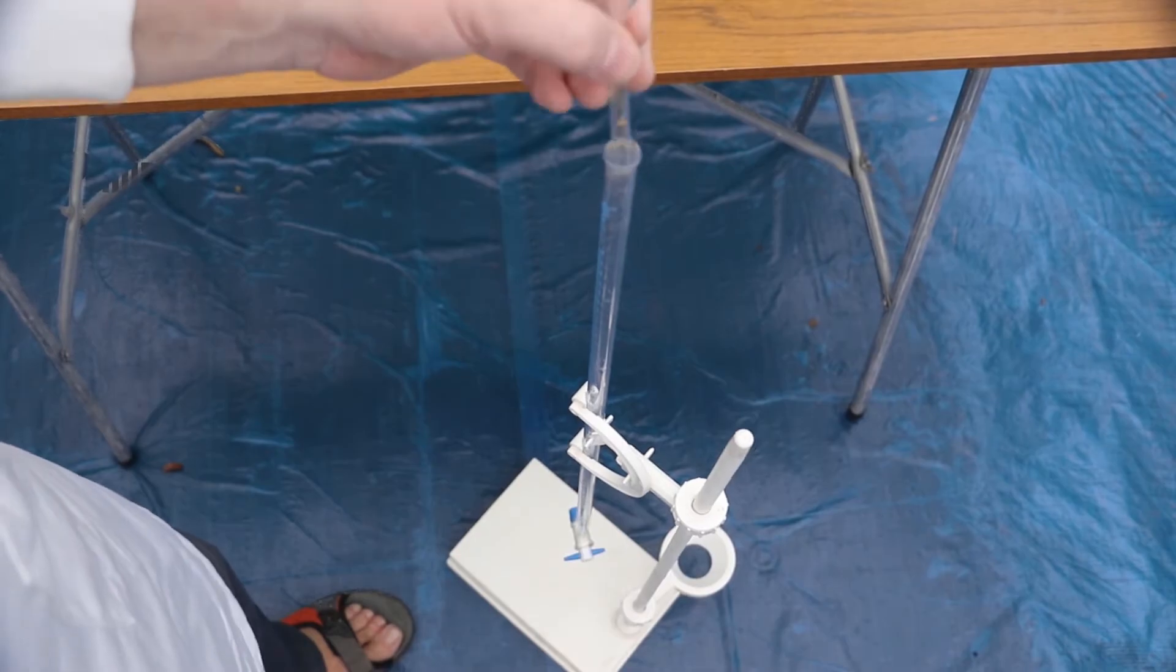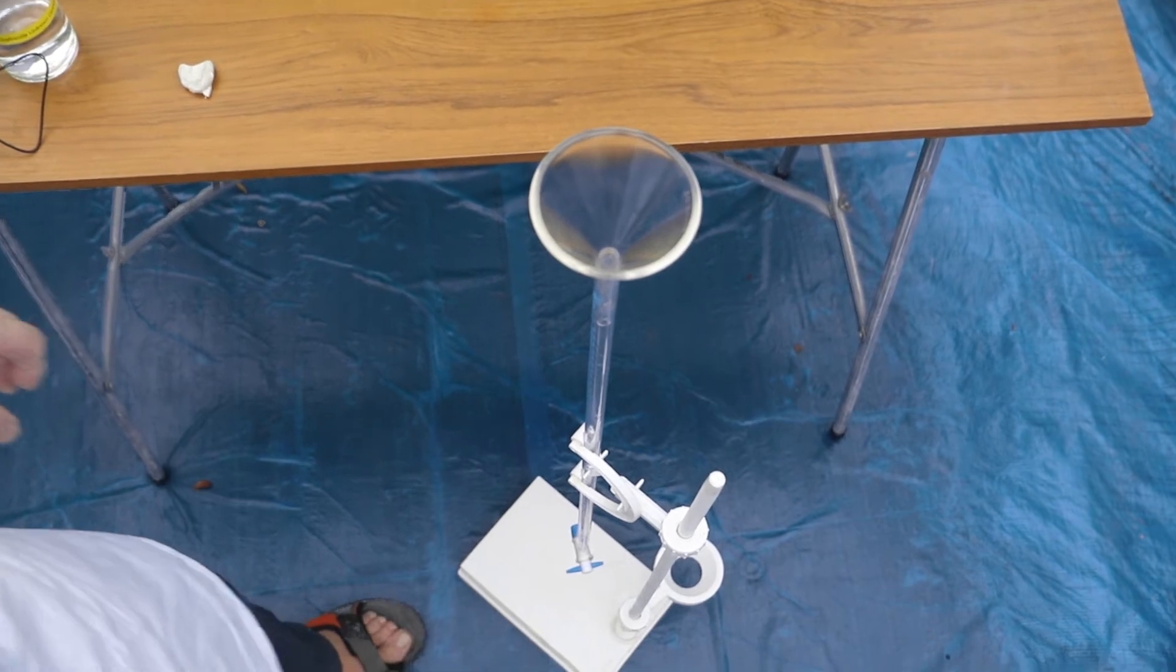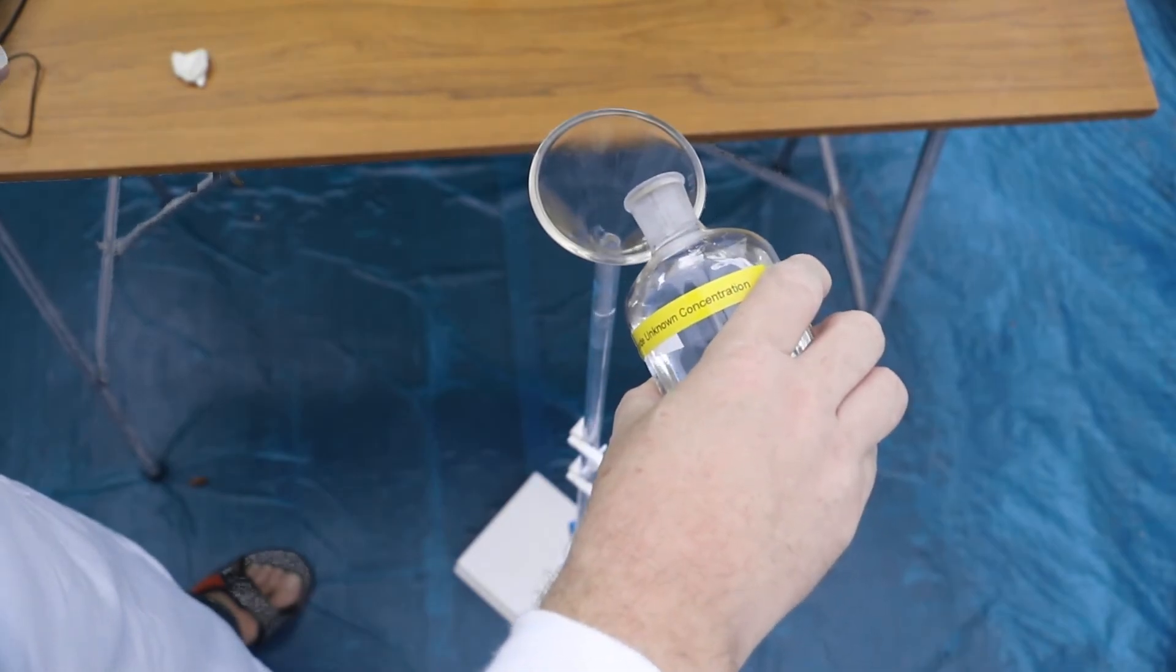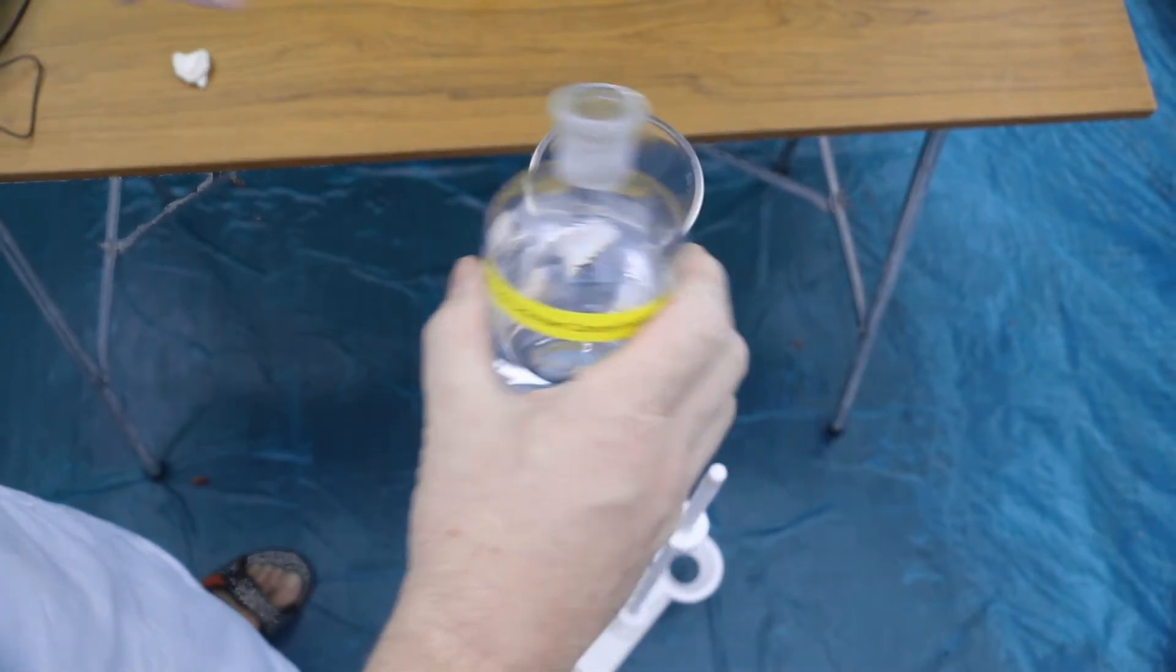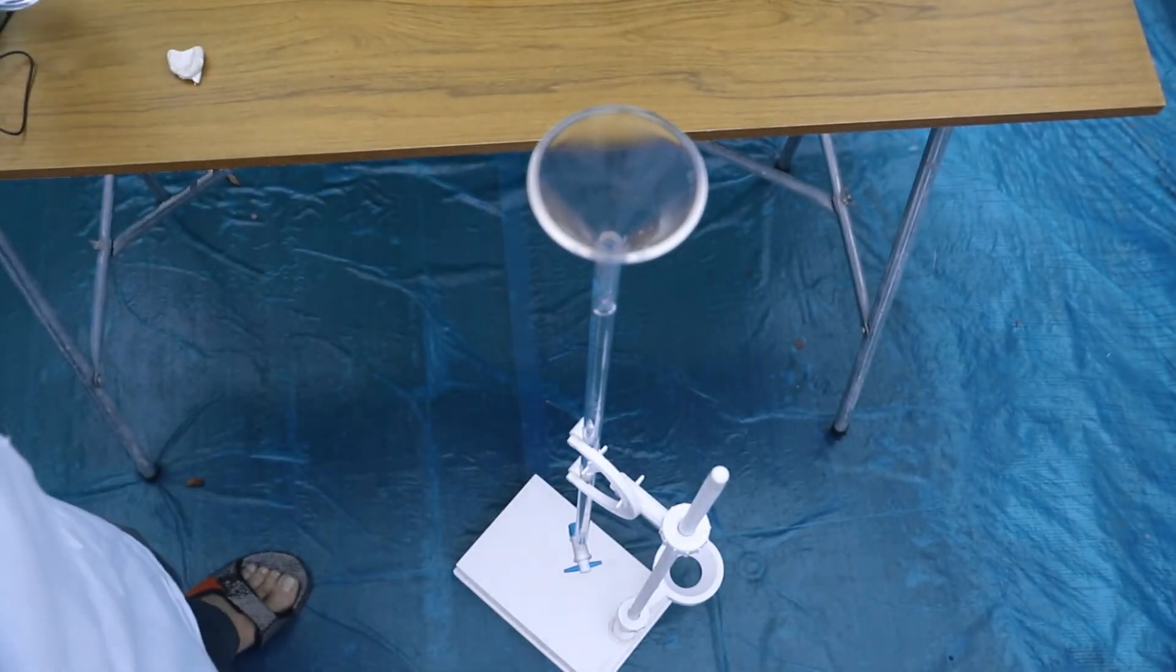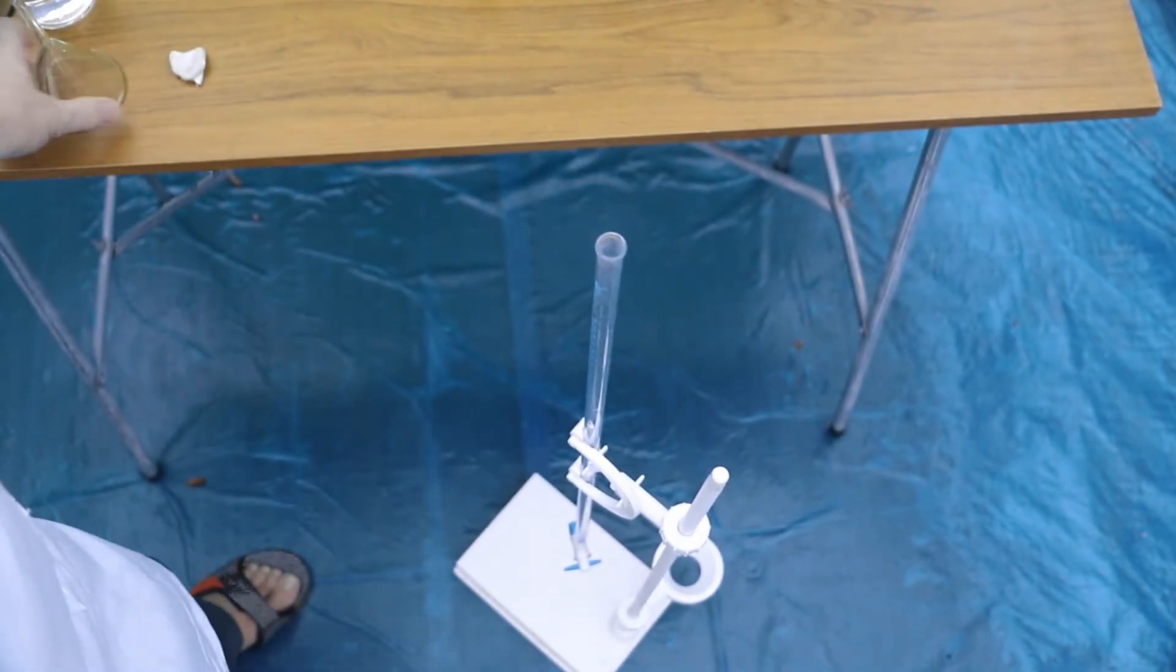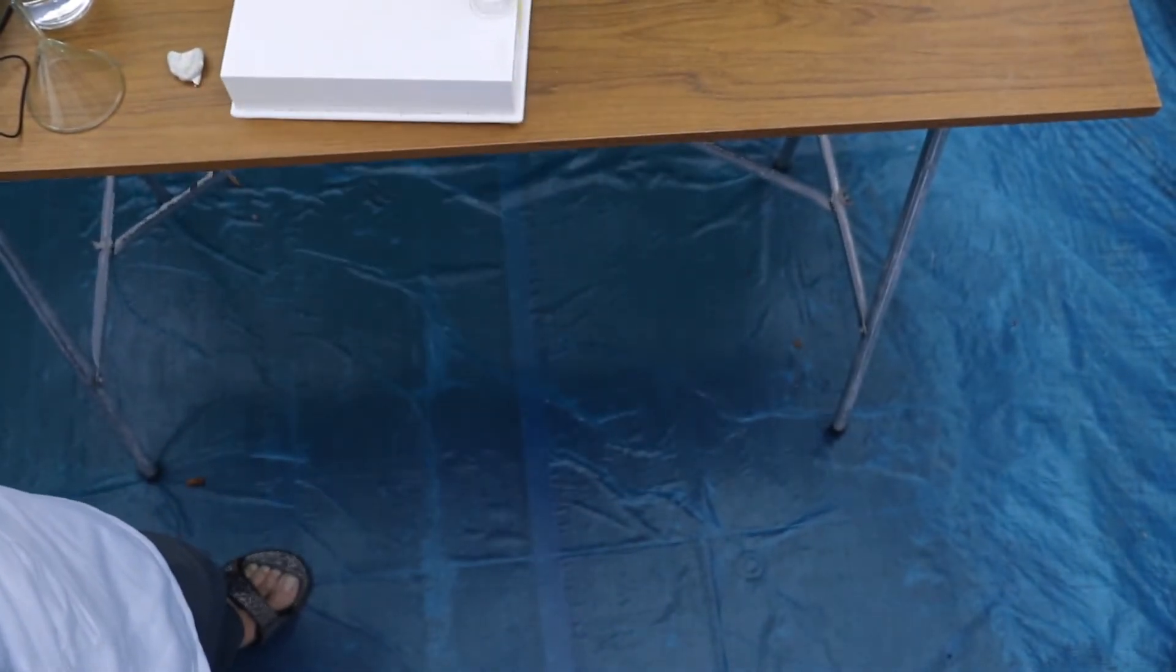Because I can't reach, I'm going to put a funnel in here. Then we can fill up the sodium hydroxide on the ground, making sure that the tap is shut first. Having put in the unknown concentration of sodium hydroxide in here, then we can put this back up on the bench so we can do the titration.